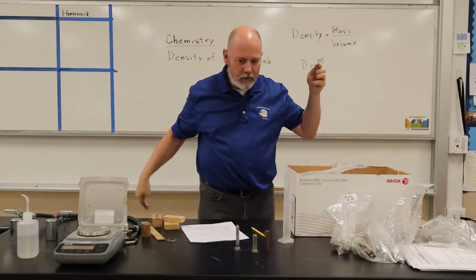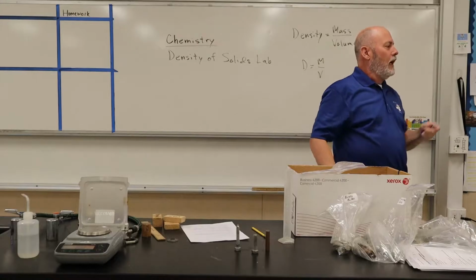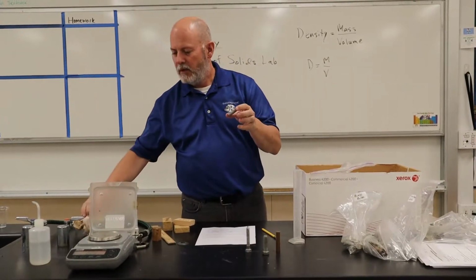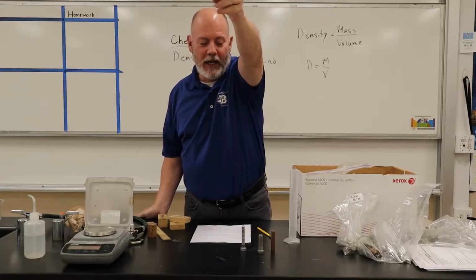I'm getting water all over everything. All right. Paper towels? Over there. I got it. Okay, here we go. So there's the aluminum, just so you can see what it looks like. All right, I dried it off.